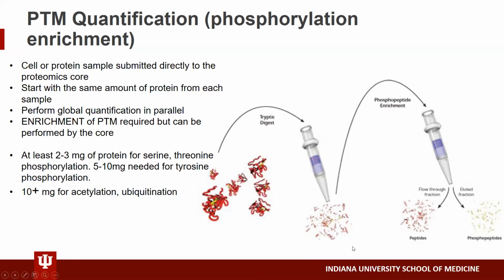So there's significantly more sample prep involved in post-translational modification, and there are definitely some aspects of the enrichment steps that can be tricky. So always feel free to reach out and chat with us about it.